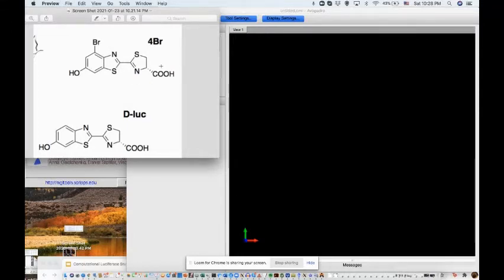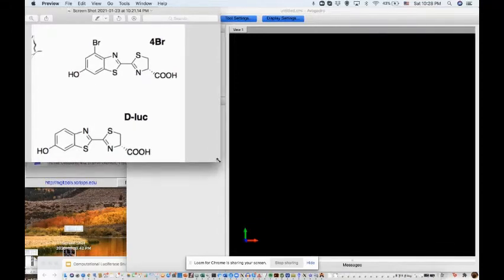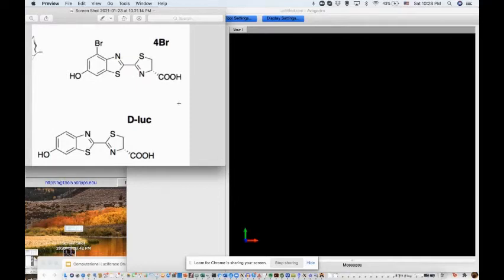So what we want to do is dock these two molecules into firefly luciferase and see which one it binds better. That is just an example of things you can do with AutoDock. You could imagine a similar process that you might want to do on the TAC team if you have different 2' modifications as part of your nucleotides. You might want to see how those dock into different TAC mutants. But yeah, we're going to stick with this luciferase example.